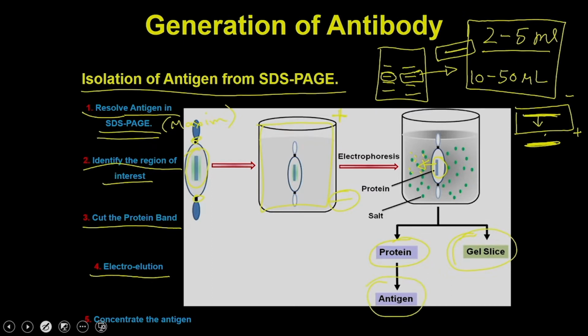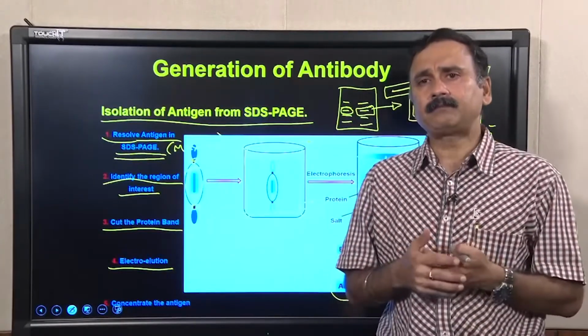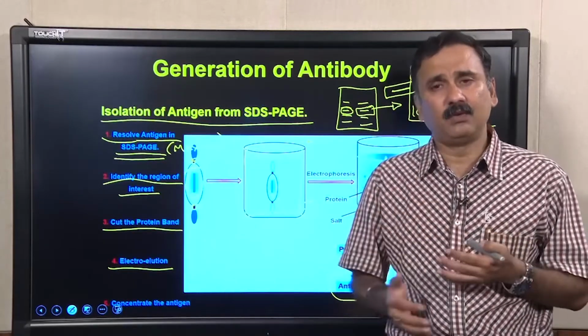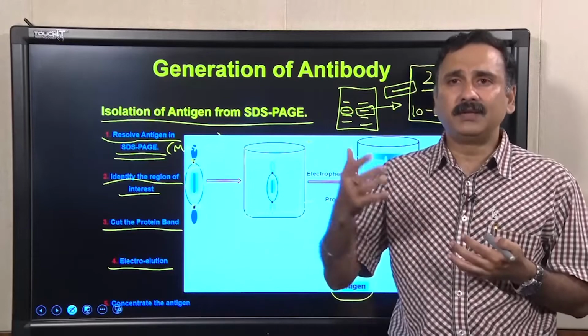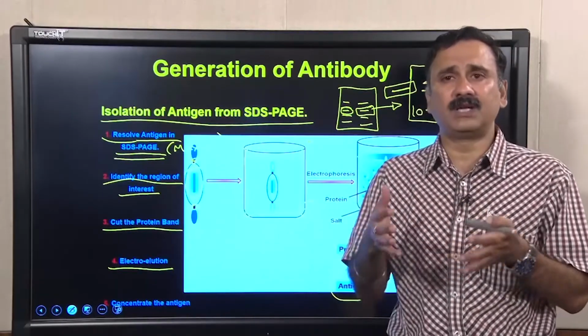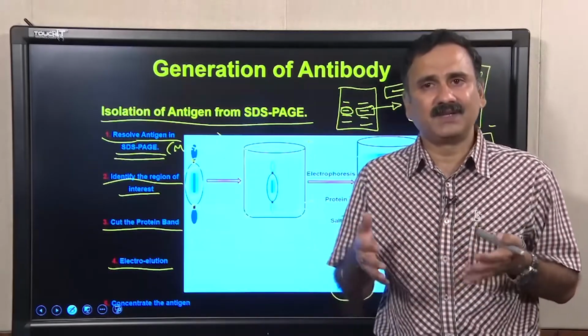So this is a very simple procedure and very easy to perform. It is routinely used to isolate antigens which are very difficult to overexpress or which are not soluble, or other kinds of conditions that we have discussed.